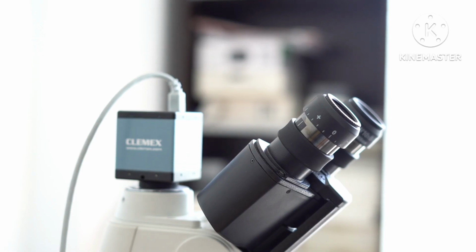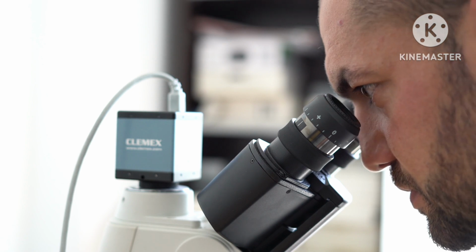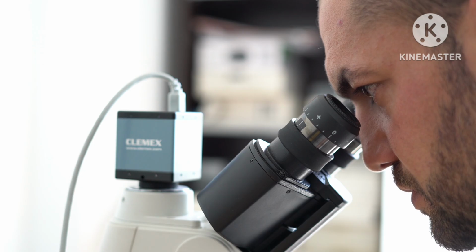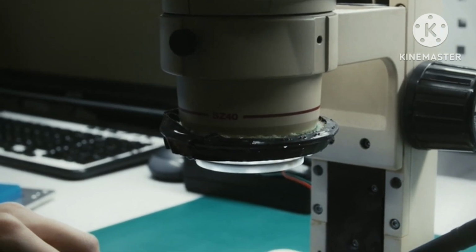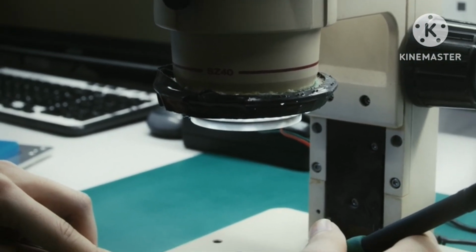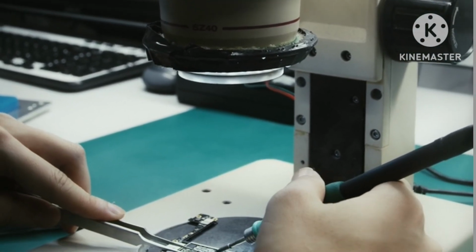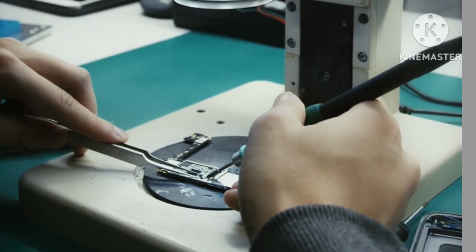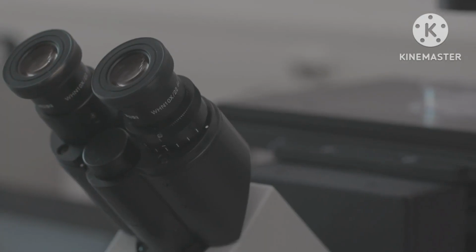You need magnification. You need clarity. And that is exactly what a microscope gives us. So, the simplest definition you can remember is this: a microscope is an instrument that magnifies tiny objects so they can be seen clearly. Now, the next question is very important.